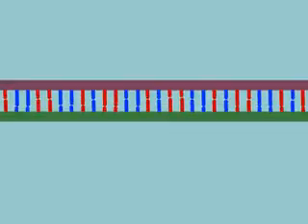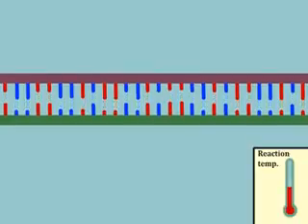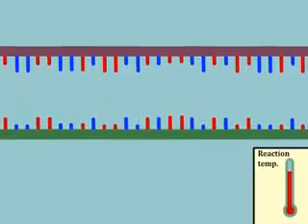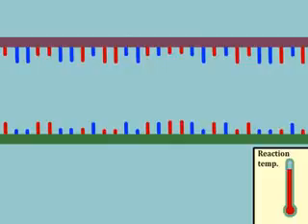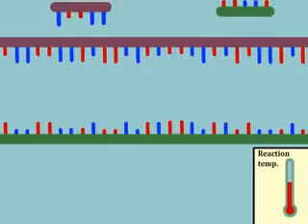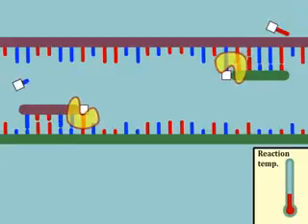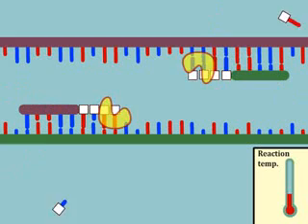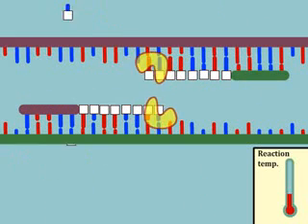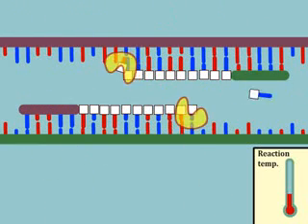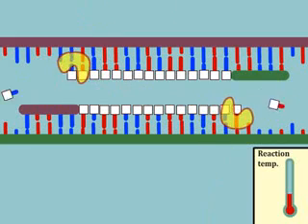Recall that the first step in any PCR cycle is to raise the reaction temperature and melt double-stranded DNA. Then, when the temperature is lowered, the specific primers bind to the sequences at each end of the target DNA. The intervening DNA can then be synthesized by polymerase reactions in opposite directions. As a result, you produce two double-stranded copies of the target DNA when you started with only one.